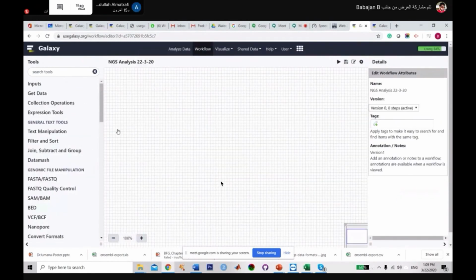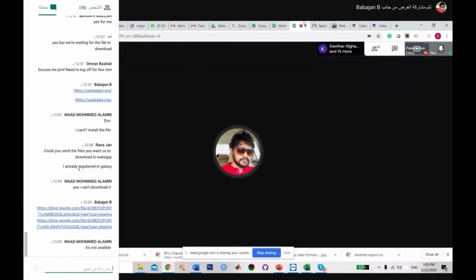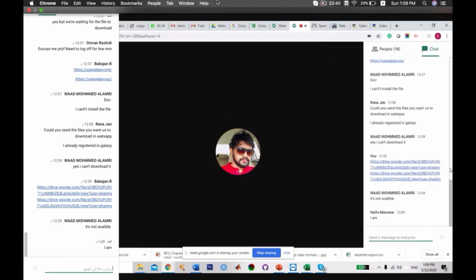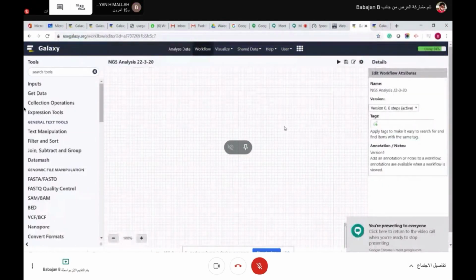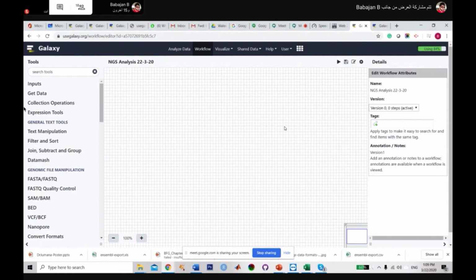Is anyone recording this video? Yes or no? Okay, good, I think you're recording. So if you have any doubts, you can ask Haifa. She's going to share the video for you. We can just go back and see how I did this one. You can do the same steps here.